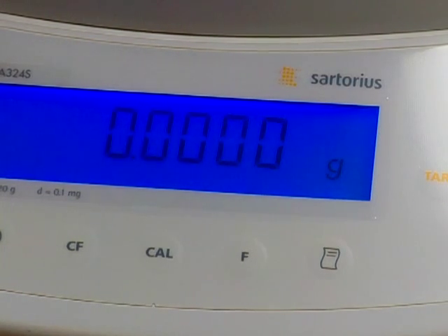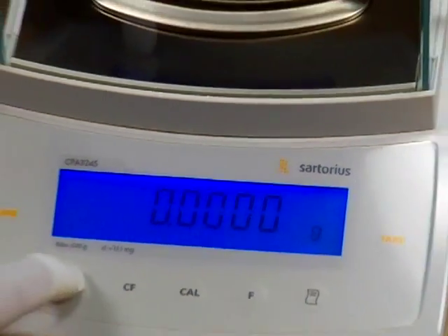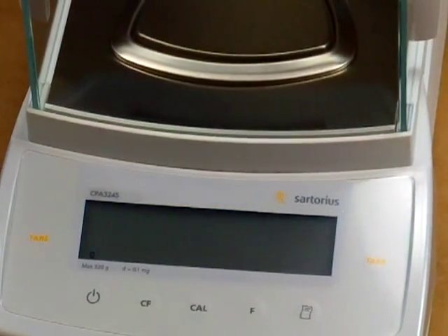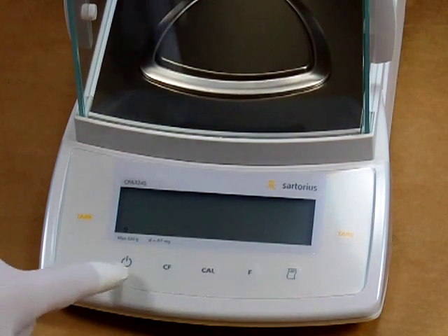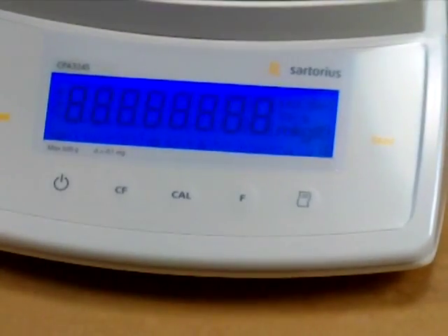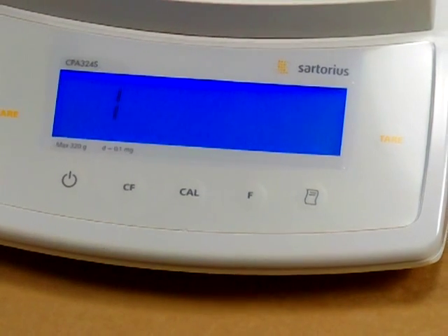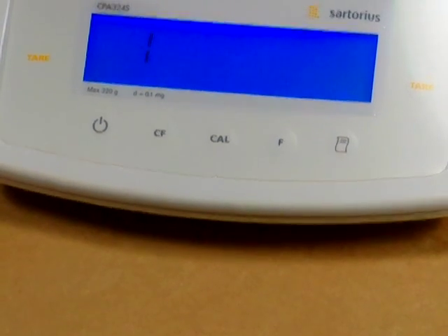The balance was right on the money. What we have to do now is shut off the balance and get into the menu to change it from internal Cal to external Cal. We turn on the power and press the tare key once to get into menu mode. The menu is presently set to 193 and we need to change it to 191.